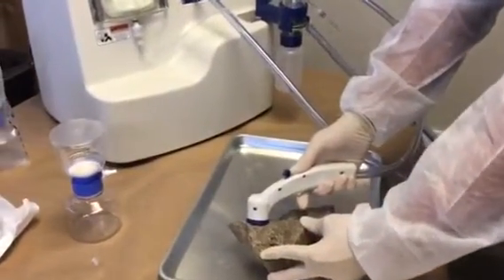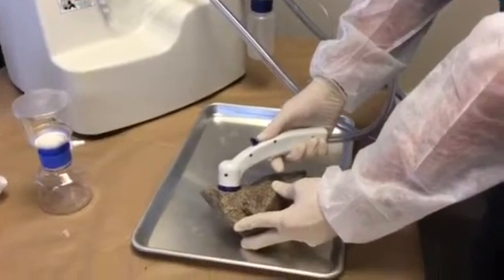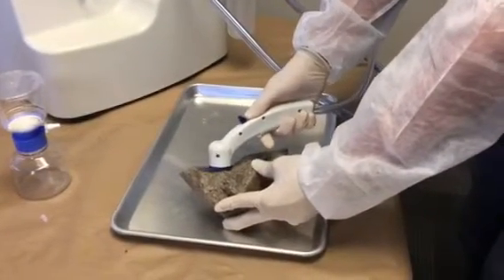I just put the sampling head right on top of the rock, put the solution on, and here we go.